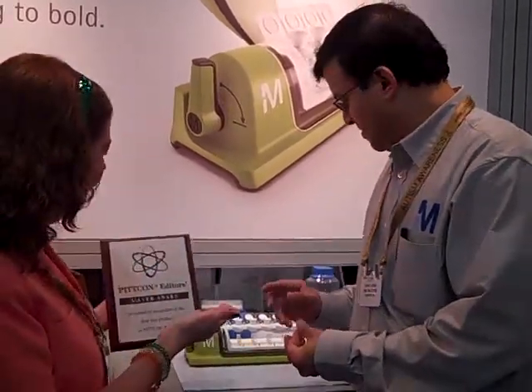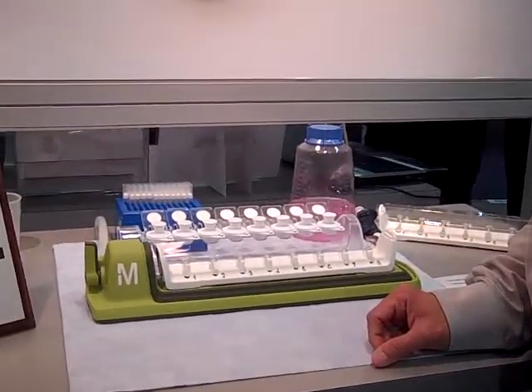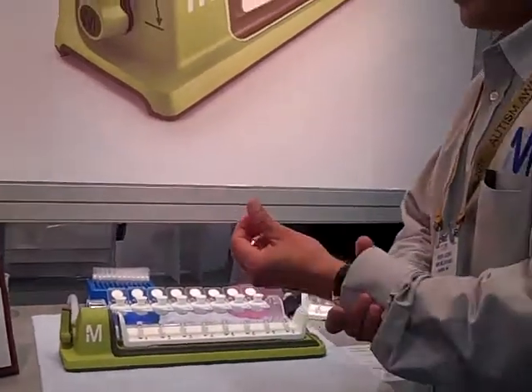We're here with Vivek Joshi of EMD Millipore, the Silver PitCon Editors Award winner for 2011, for the Simplicity Sample Filtration System. Vivek will be demonstrating why this was such a hit with all of the editors.